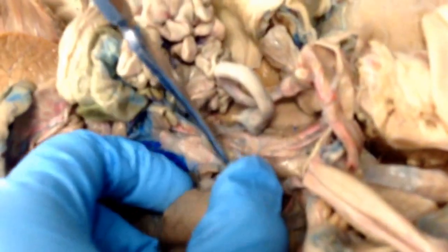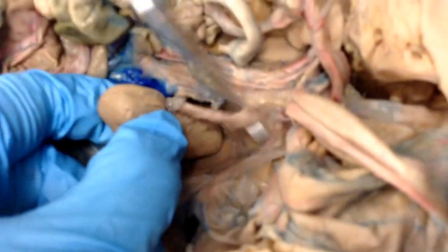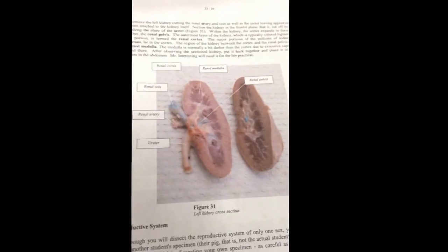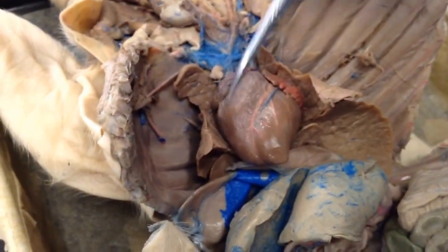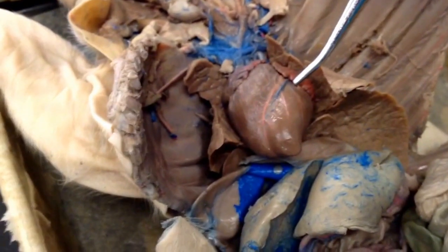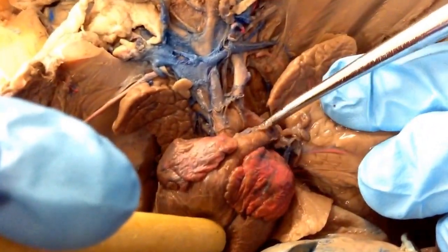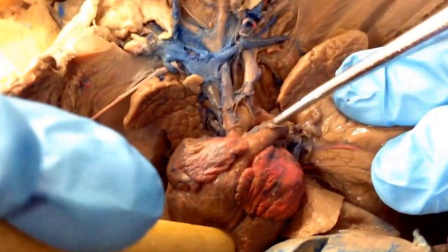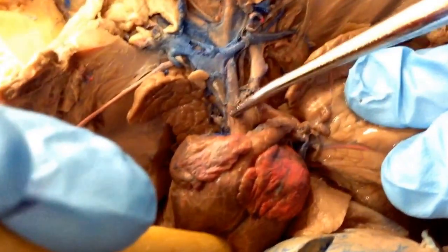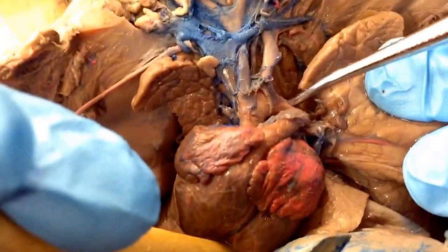Kidney, it's attached to that thing by the renal vein and renal artery. And right there is the ureter, which leads down into the urinary bladder. Left ventricle, the right ventricle, the left auricle, the right auricle, and that's the coronary artery. Pulmonary trunk. That is the ductus arteriosus right there, which connects the pulmonary trunk to the aortic arch.